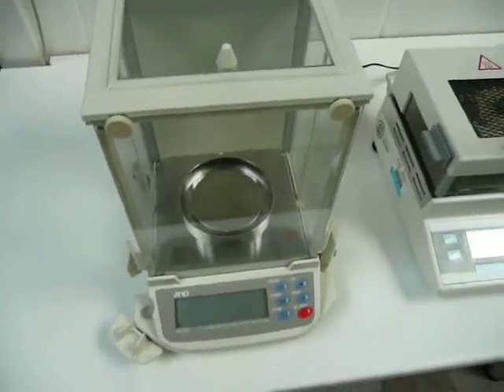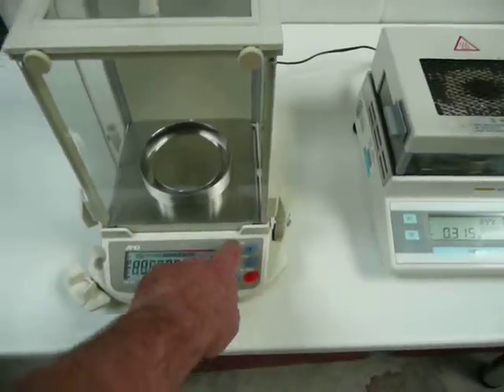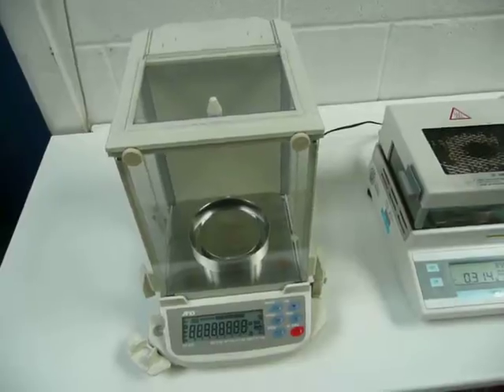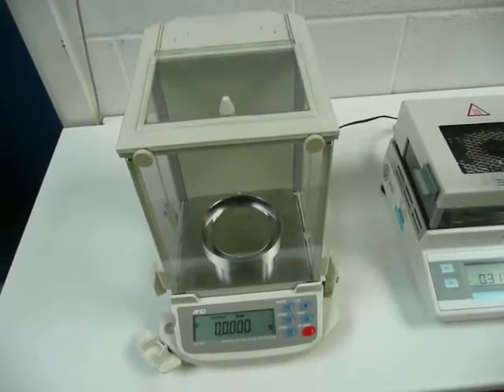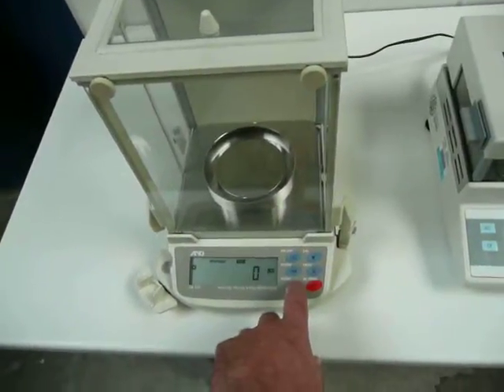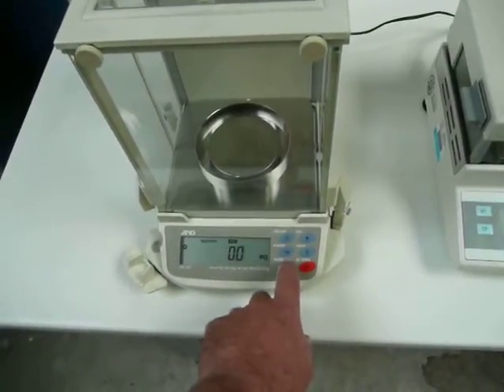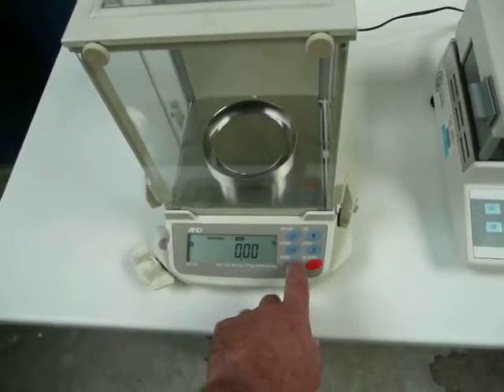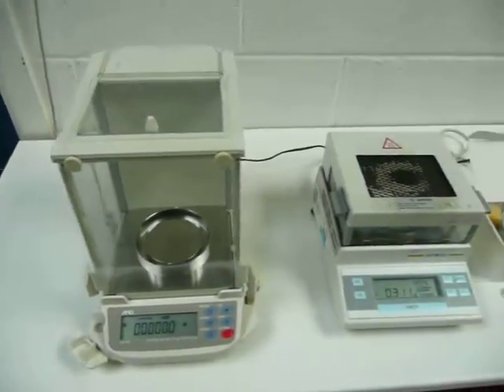And finally we've got the A and D balance here, which is a 3, 4 and 5 decimal place, maximum 210 grams. It will do 3, 4 and 5 decimal places which is pretty good really. So that's the A and D GR202.